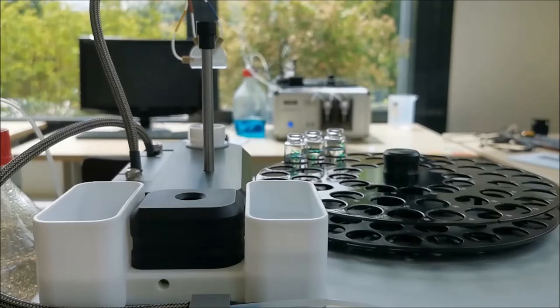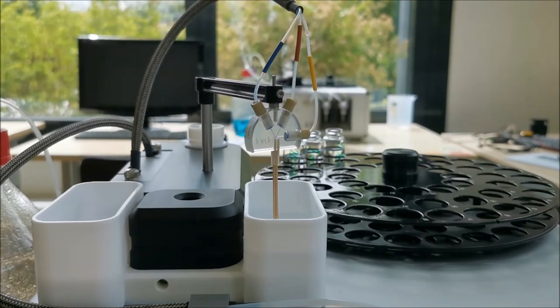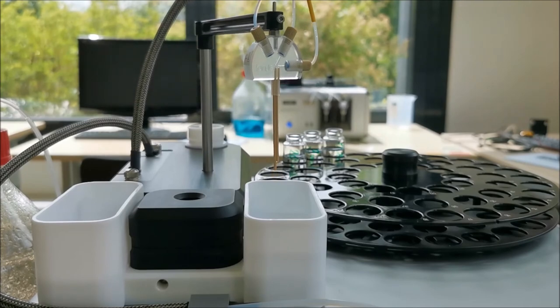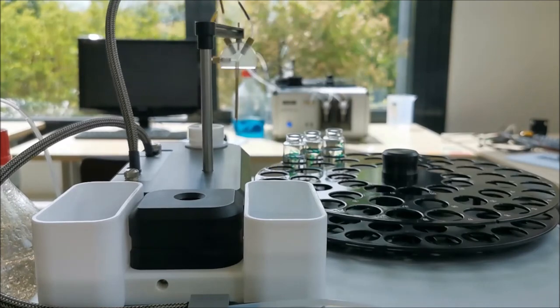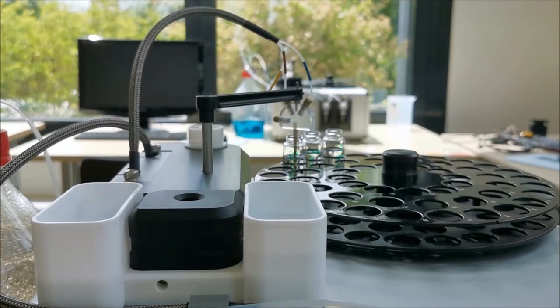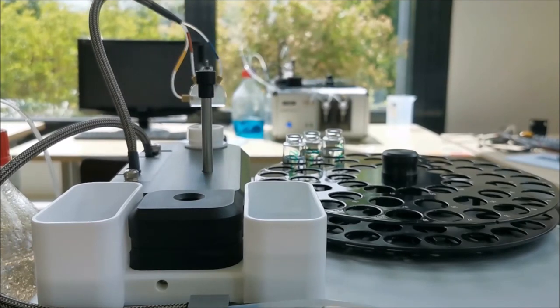Now the second measurement begins. We switch to another angle to better observe the actions of the pipetter. By the way, the name of the pipetter is ion jet. The ion jet takes up non-activating solution here. Then the ion jet moves to the activating solution. It dispenses non-activating solution into the wash station.